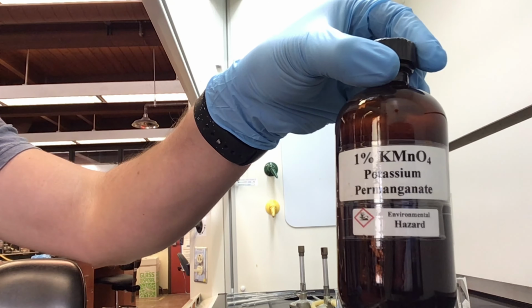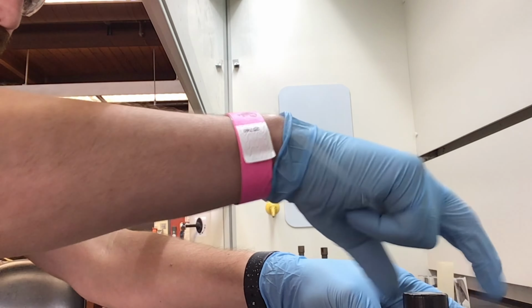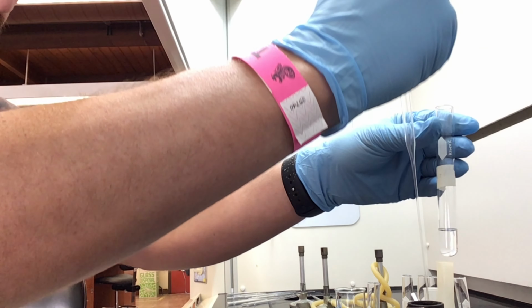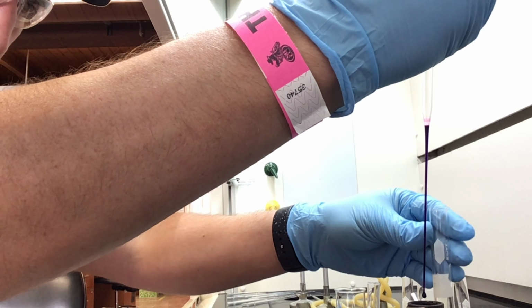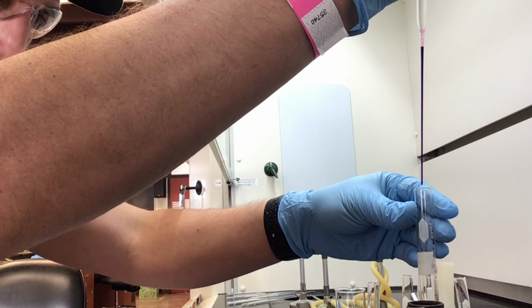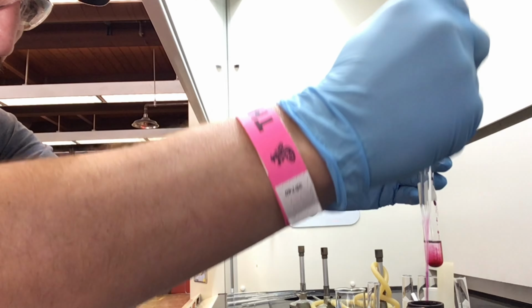So I've got my alkene, and I've got my 1% potassium permanganate, KMnO4. This is a provided solution. You won't be required to make this, but just do a little droppity drop in here. Remember, slowly, of course. Make sure you have control of the liquid in the pipette before you move it over to the tube. Then 1, 2 drops, and then observe.